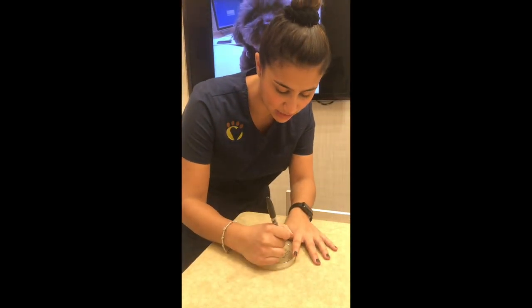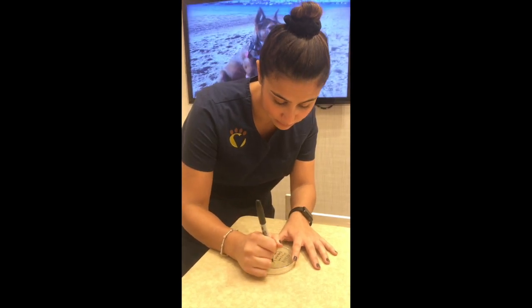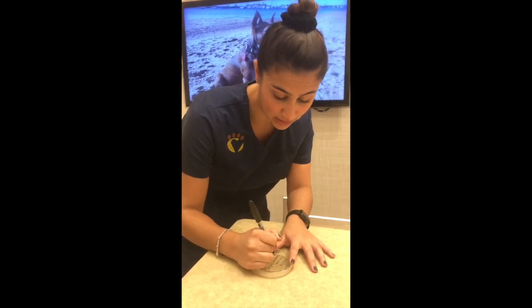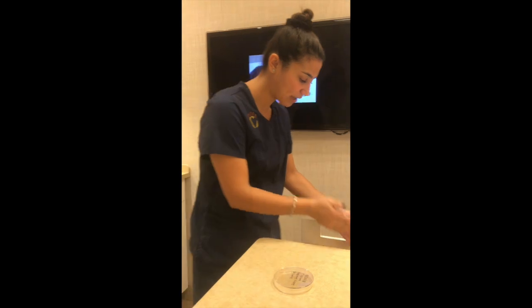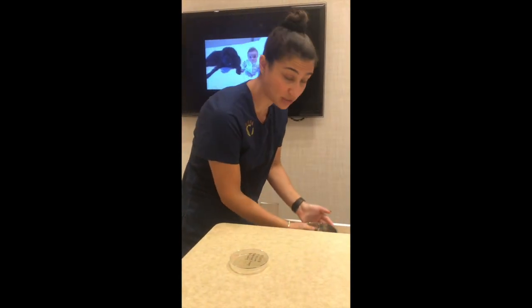I'm going to write our patient's name, which is Captain Love, just like that, and then our doctor who's on the case, which is Dr. Love. Great. So now that I have my sample, I'm going to put it in a drawer here. I actually already have some water in here, just so that our sample doesn't dry out.